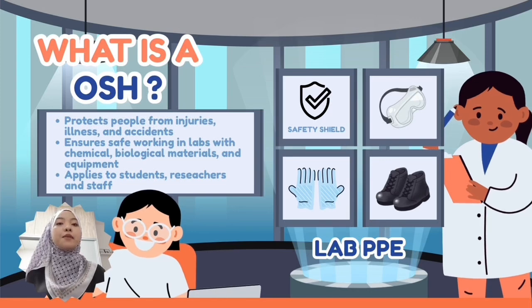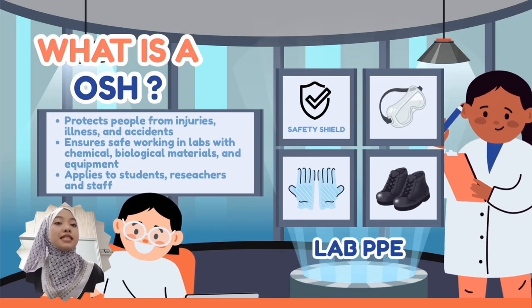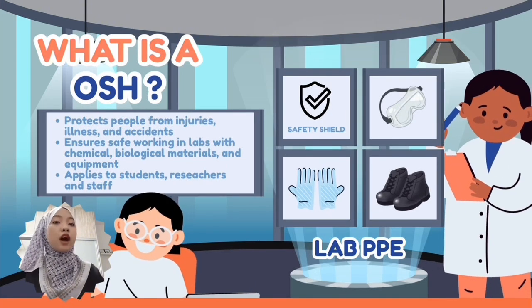What is OSH? Occupational Safety and Health, or OSH, focuses on protecting people from injuries, illnesses, and accidents in the workplace. In laboratory environments, OSH is especially important because students and staff regularly handle chemicals, biological materials, and special equipment that can be hazardous if not managed properly.